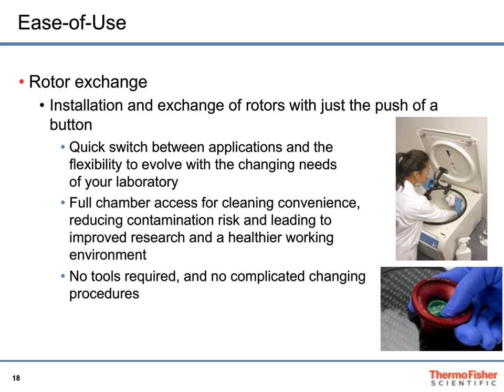So what I like to mention to users when I'm talking to them is, if you haven't bought a centrifuge lately, you pretty much should think about what you want to do, because if you just say, well, I've got a centrifuge over here and it's old and it's dying and it sparks or whatever scary thing it does, and I just want another one like that, that's probably not a smart move. There's probably, as I said before, an ability to make a much wiser choice given the options that we have today in centrifugation. The phrase I like to say is, it's not the 80s and 90s anymore.